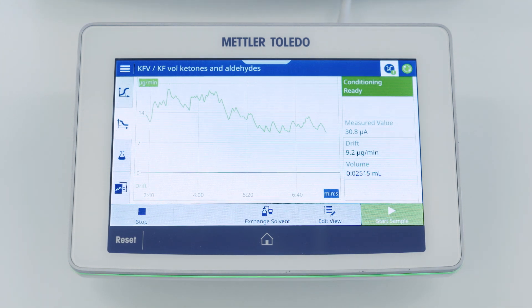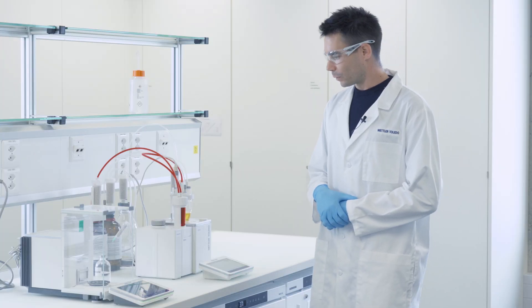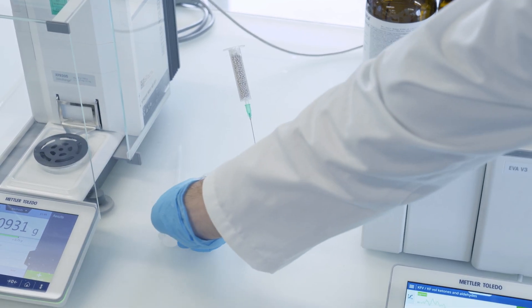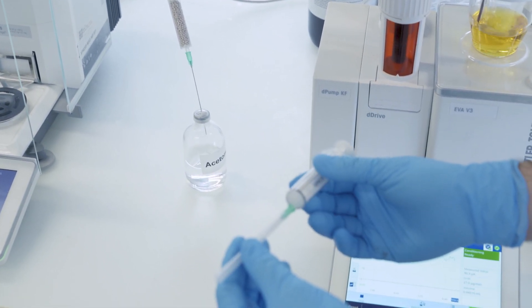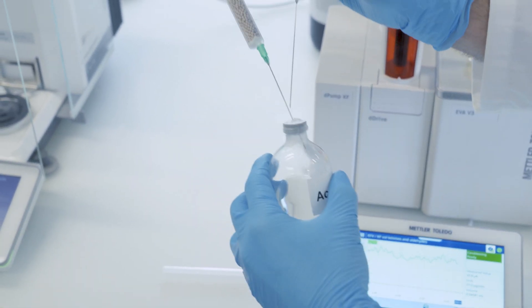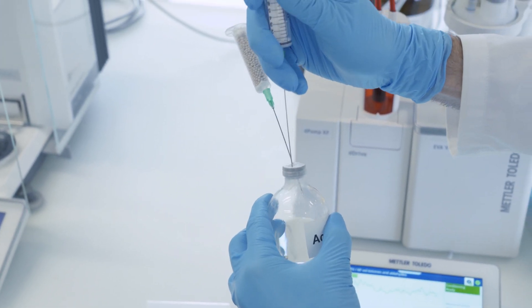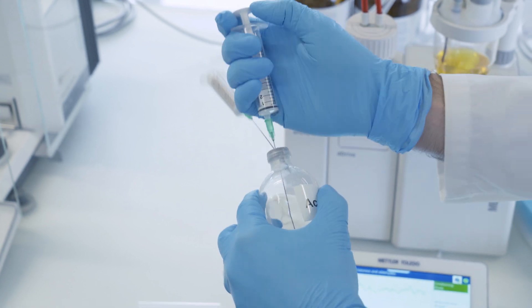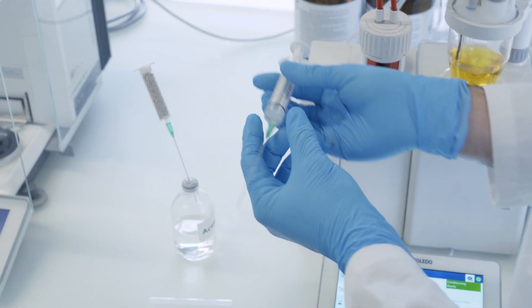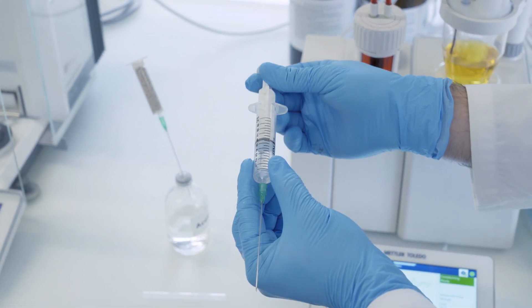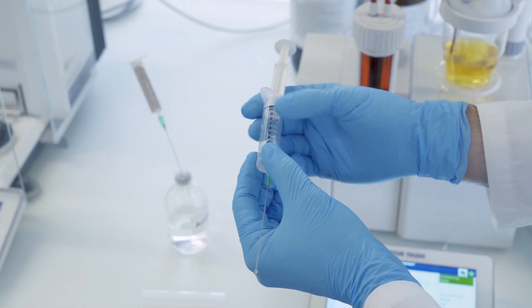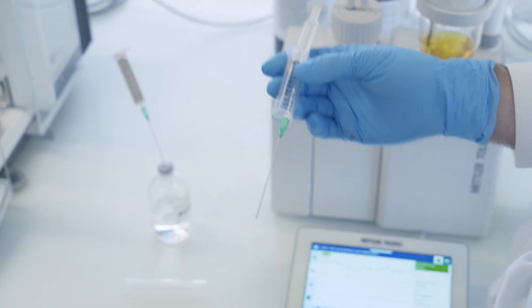We will now prepare the sample. We will determine the sample by manual injection via a syringe. To do this I take a little bit of the sample and I wash my syringe with the sample. The sample that I used for washing can be discarded.